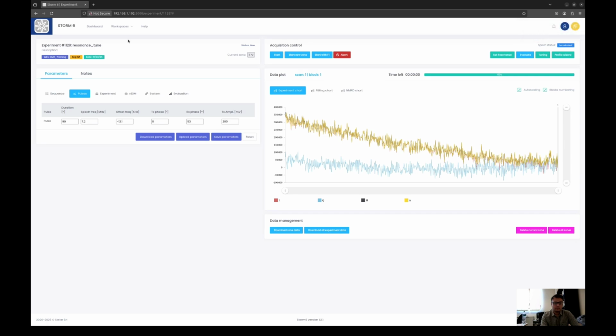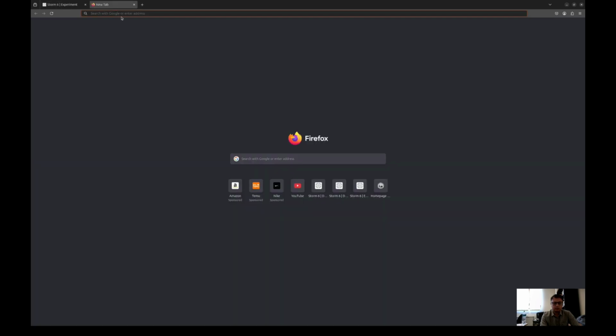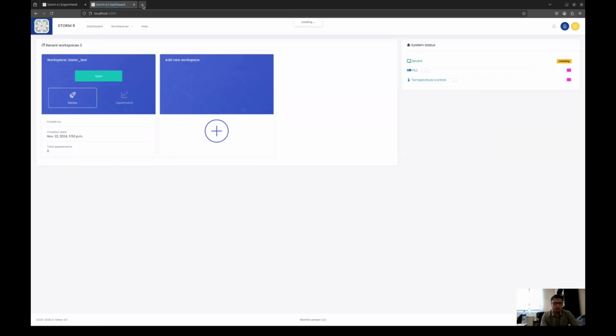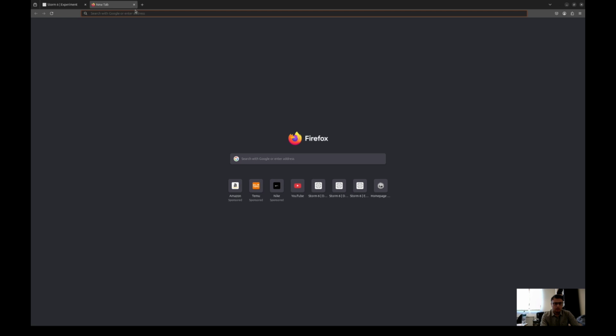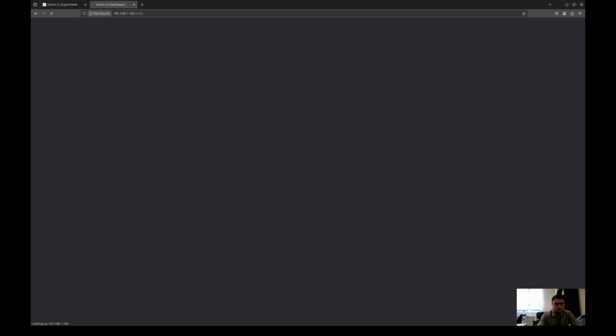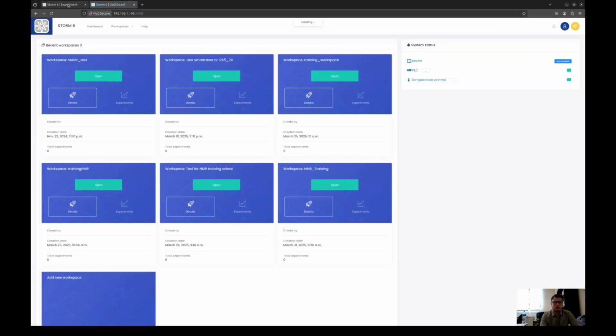After getting the resonance condition, the next step is to get the proper pulse duration, which we already have, but I will re-verify whether the pulse duration we are using now is correct or we have to change it.